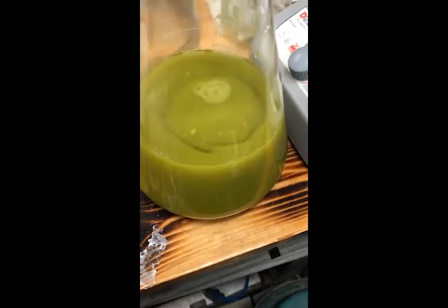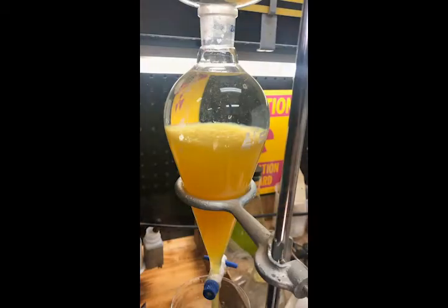The green color here is due to dissolved ions in the stripped liquor. As the precipitate settles, it will reveal its bright yellow hue.